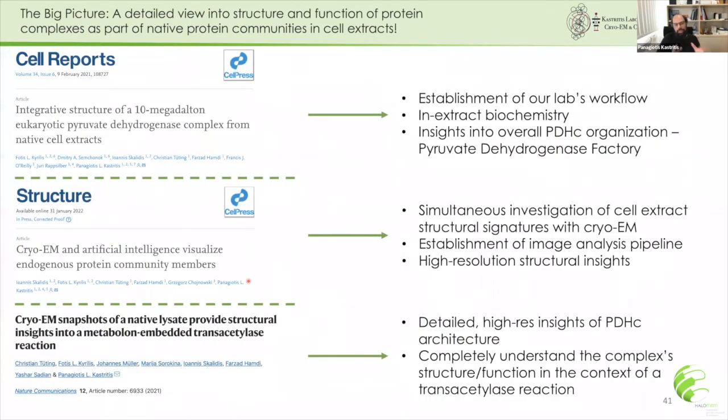So what I presented to you today is some results from our 3 papers from the lab. In the first paper, we derived the full higher order structure of the pyruvate dehydrogenase complex.